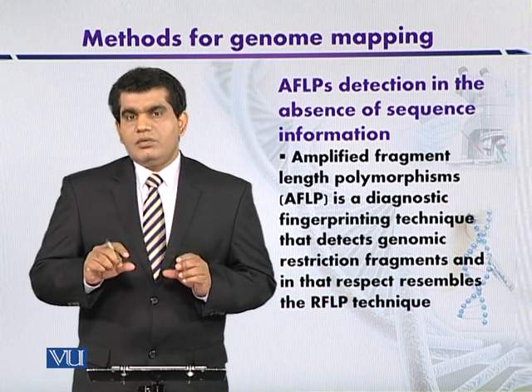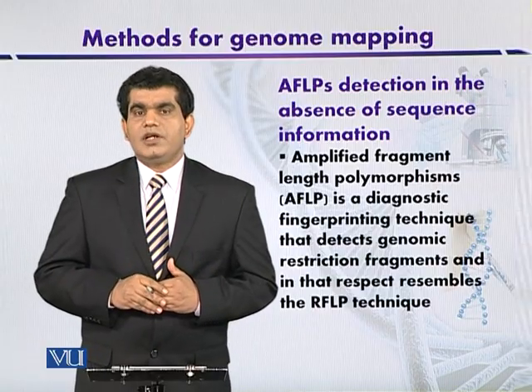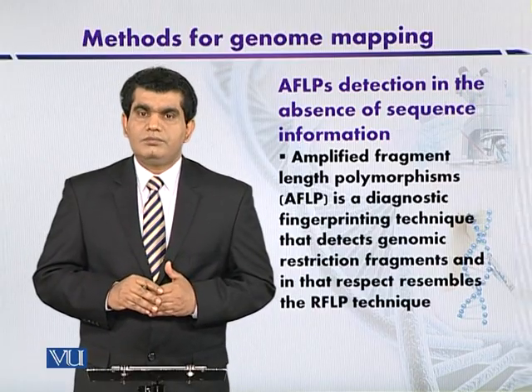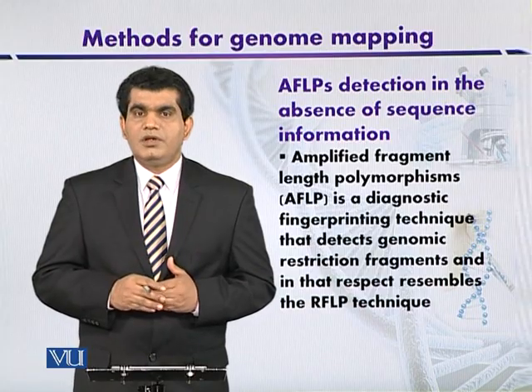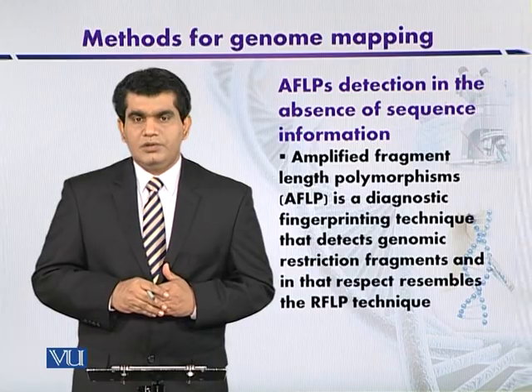So now the sequence of the ends of the DNA fragment is known, so that we can now develop site specific primers by using the sequence of the adapter molecule.